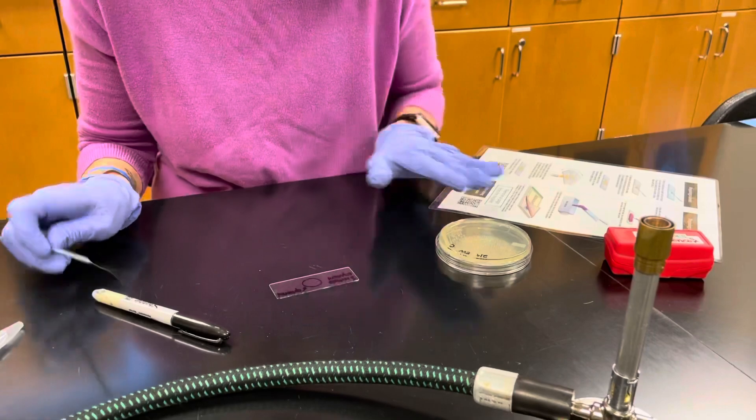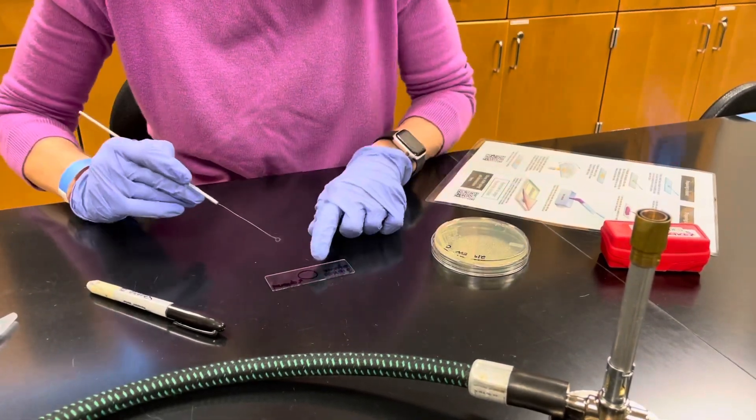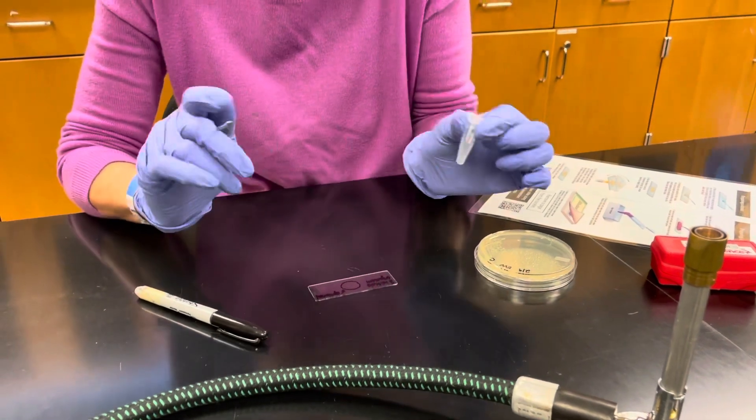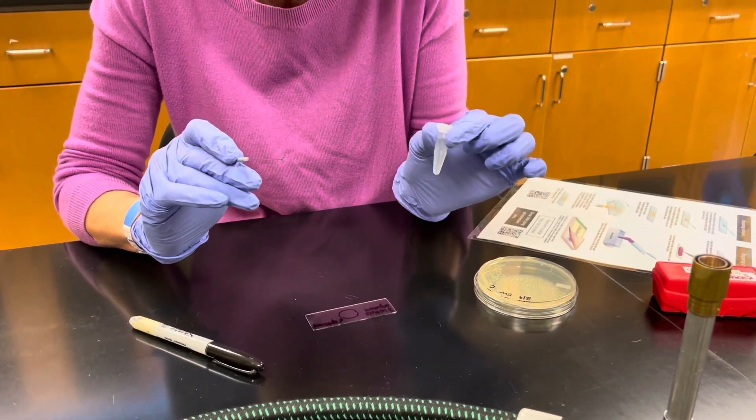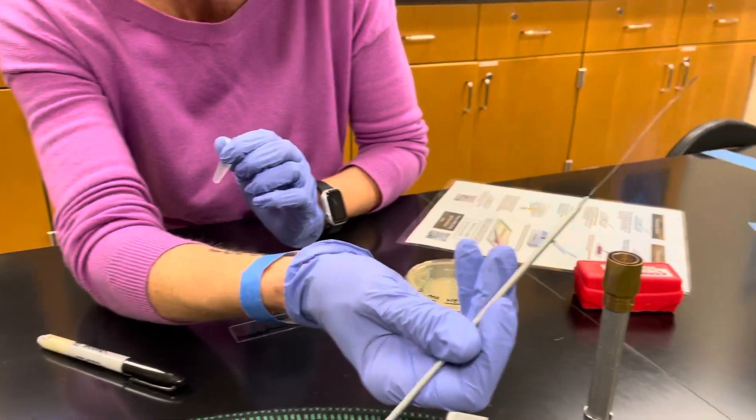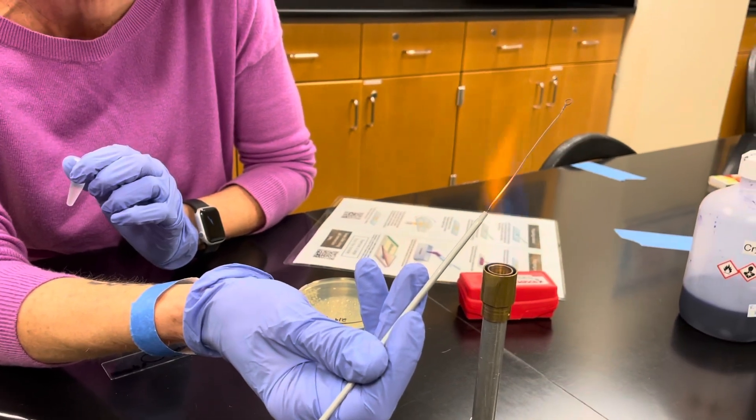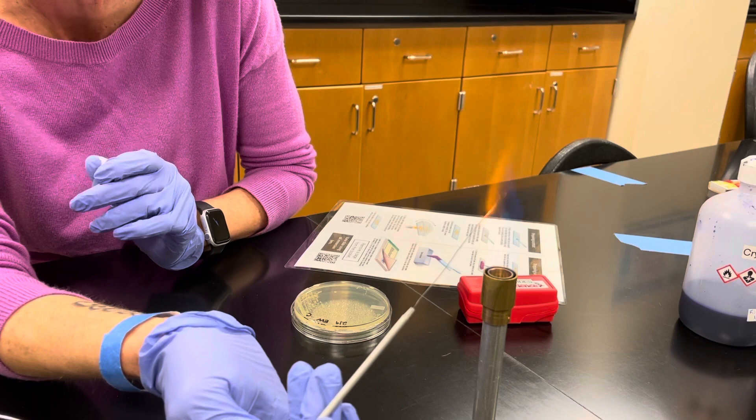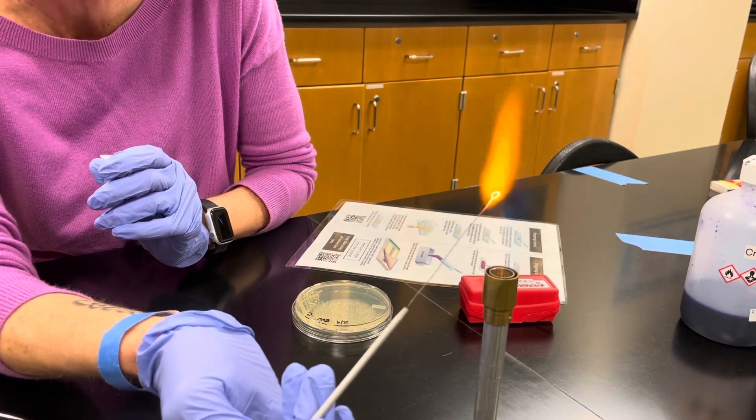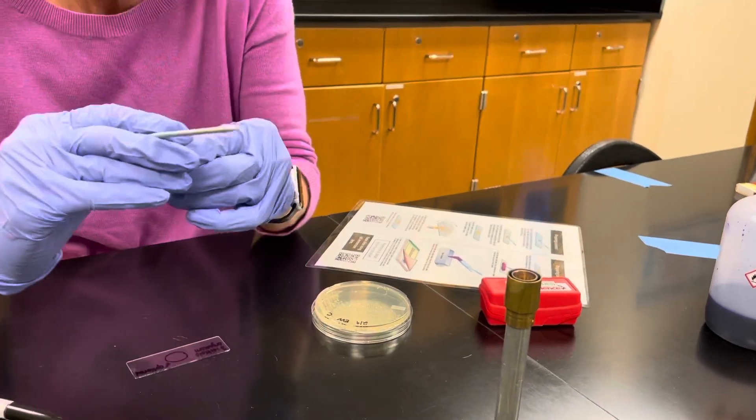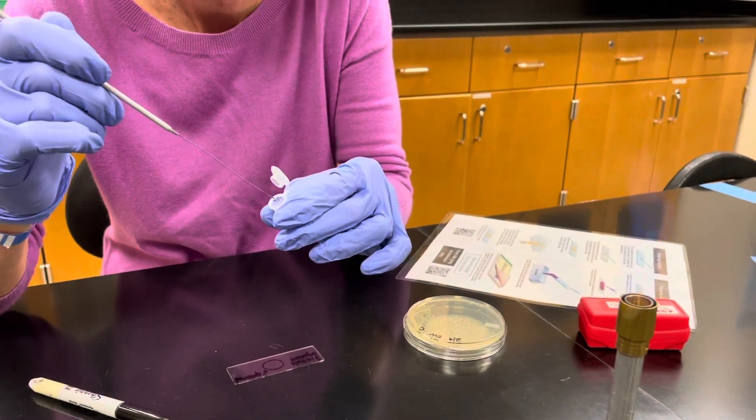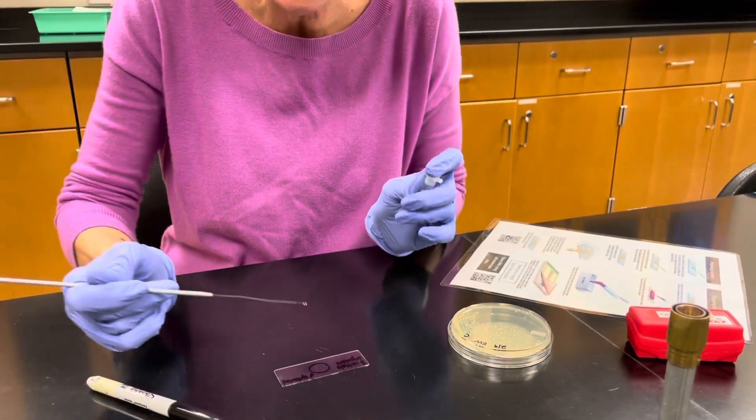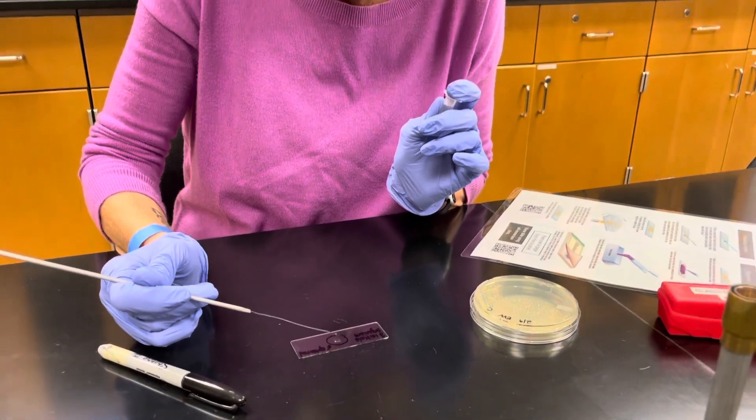Since we are taking bacteria from a plate, we need to get a loopful of water onto our slide. In your kit, you have an Eppendorf tube full of water. We're going to practice using aseptic technique. We're going to flame our loop from the base to the tip. That inner cone is the hottest part of the flame. Go ahead and just get one loopful of water. Place it in the center of your circle.